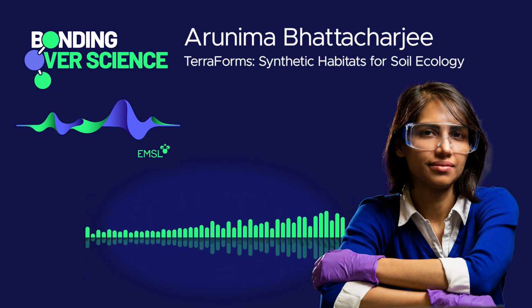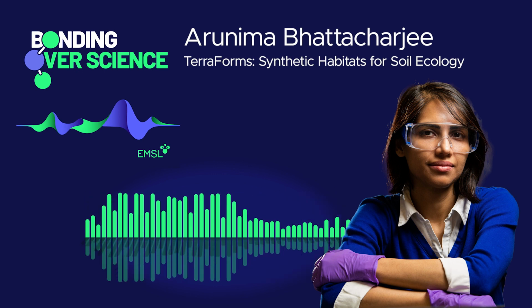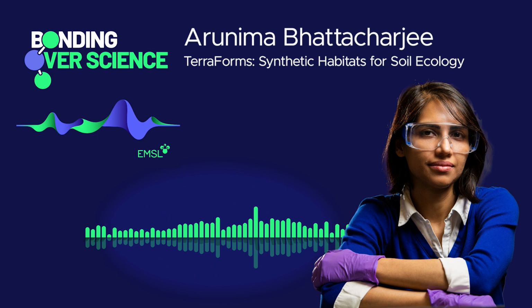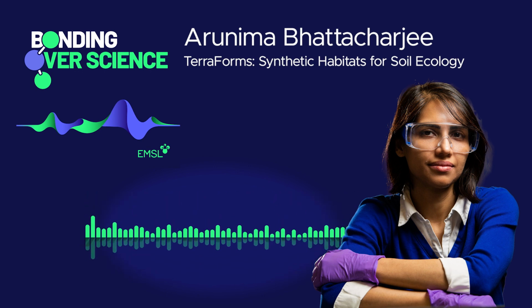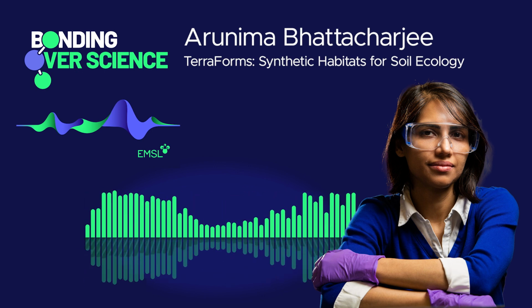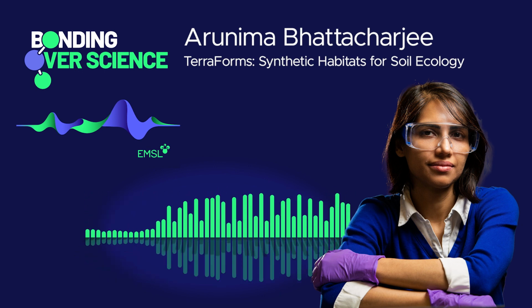The chip itself is filled with media and is maintained in a hydrated condition so that the seedling can keep growing. And so certain projects require addition of microbes. So that is done later on. We have different ports created inside of the device so that we can add microbes if required.